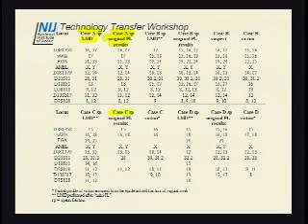So case C, the original differential extraction that was performed, they only got a partial profile. When we performed the analysis using LMD and that mini lysis procedure, we were able to get what appears to be a full profile. Also, there wasn't actually a victim exemplar. This case C victim exemplar is just the type from the differential extraction, the E cell fraction. But it didn't appear that there was any contamination into the laser microdissected sample. So that was good news. There's actually improved results in that particular case.